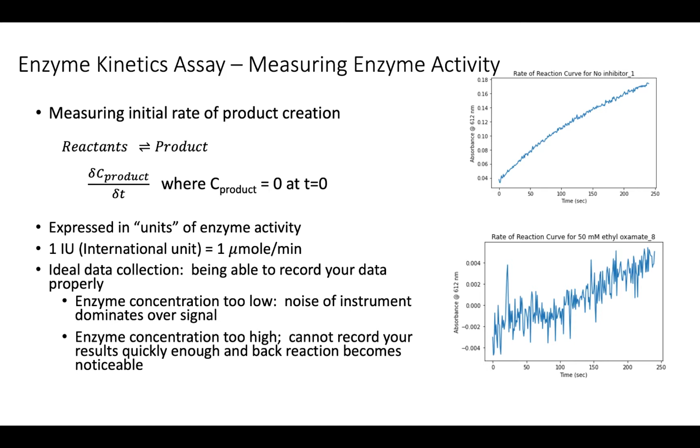So that's the kinetic assay, and what you will be seeing after you take your initial readings and move them into the analysis to determine your enzyme activity.